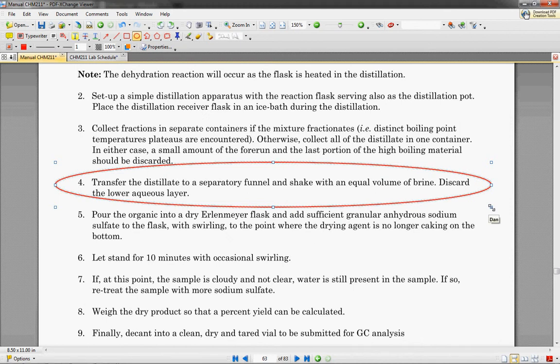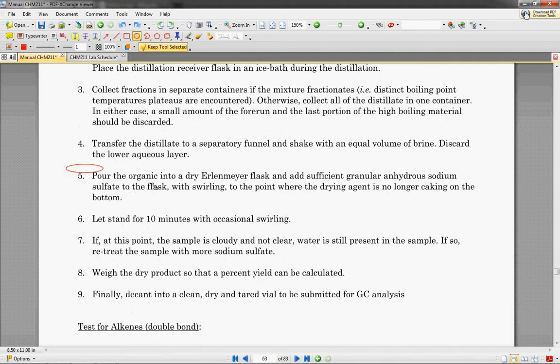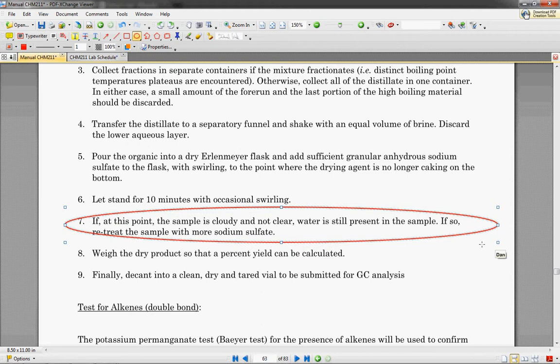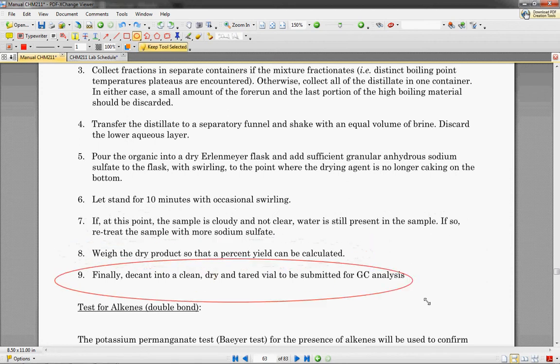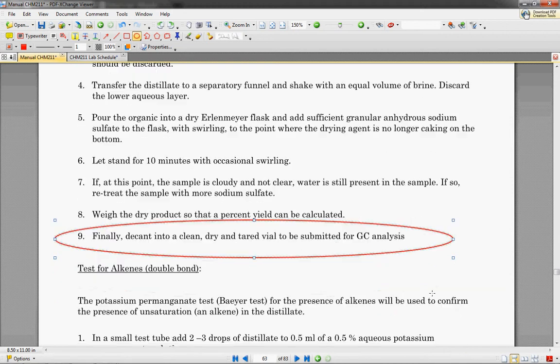Then we're going to transfer them to a funnel and dry them with brine first and get rid of the lower aqueous layer. Then we're going to pour it into an Erlenmeyer flask and add anhydrous sodium sulfate, which just is going to dry it further, and let it stand while it dries. If your sample is cloudy at this point, it means you still have water, so you need to continue drying it. If it is nice and clear, you can weigh your product and try to figure out your percent yield.